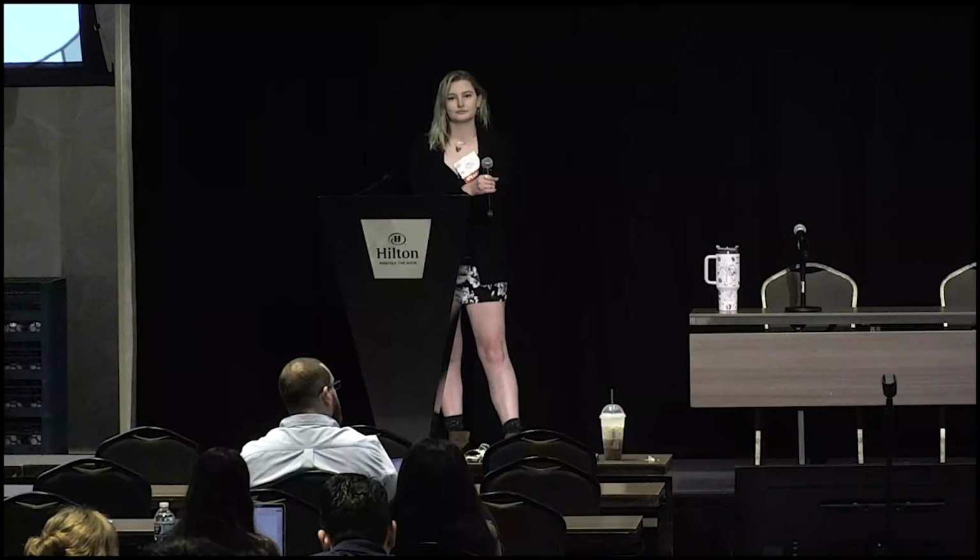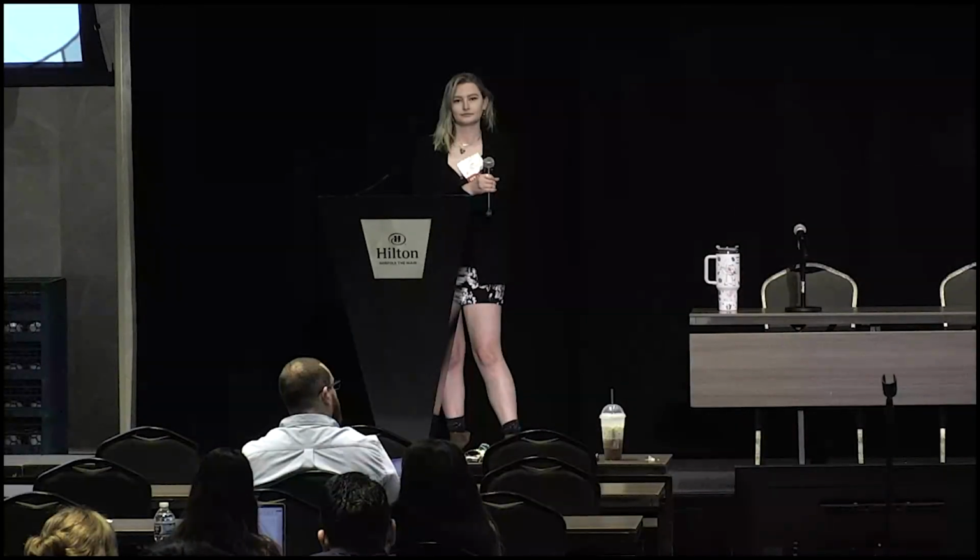The other one, and I'm not trying to make any commercials for MoClo, but you might have missed some key points of that. The first one is that it's not just 7 parts. You can actually have level P's, level M's, level 2, 1A, and so on and so forth. So we actually made a position 1, level 1 with 5 different genes by using these subsequent level 0 cloning. So in my experience, MoClo is actually better than all of the systems we have tried in the past, just for the reason that you can be so flexible, you can reclone previous parts into the initial parts and make more complex constructs.